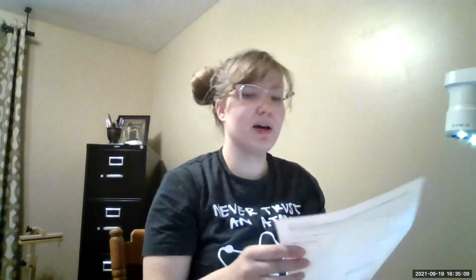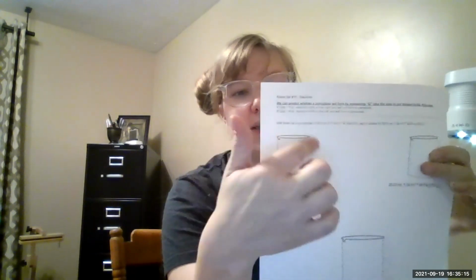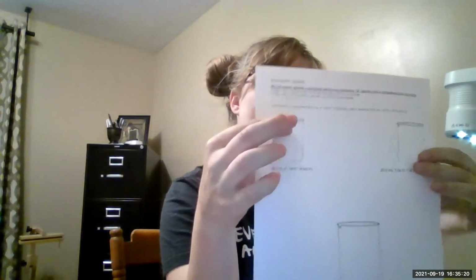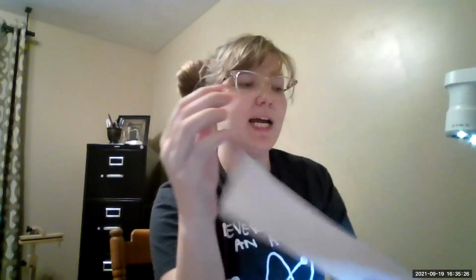So what we're going to work with today on this piece of paper is we've got two beakers. 1, 2. They're going to be aqueous solution, aqueous solution. We're going to mix the contents of each beaker into a bigger beaker and see, would they precipitate like in those videos, or would they not?